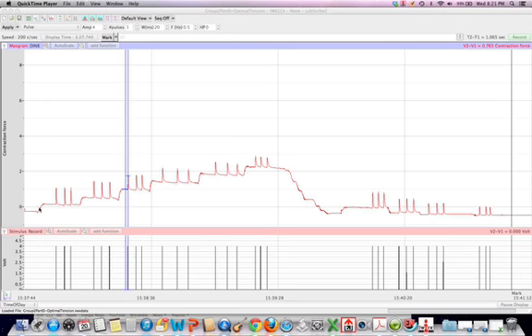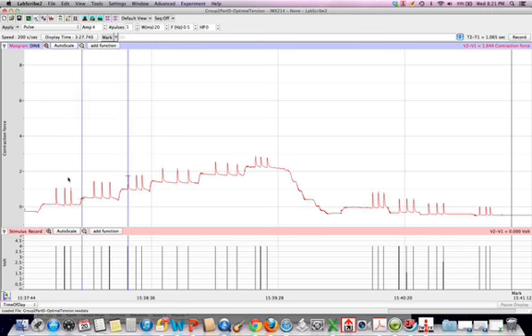Picking up where we left off, we're looking here at figure 3 for part 1. Figure 3 was just showing you where and how to measure these different peaks. Now what we want to do is show how to plug it into an Excel spreadsheet.